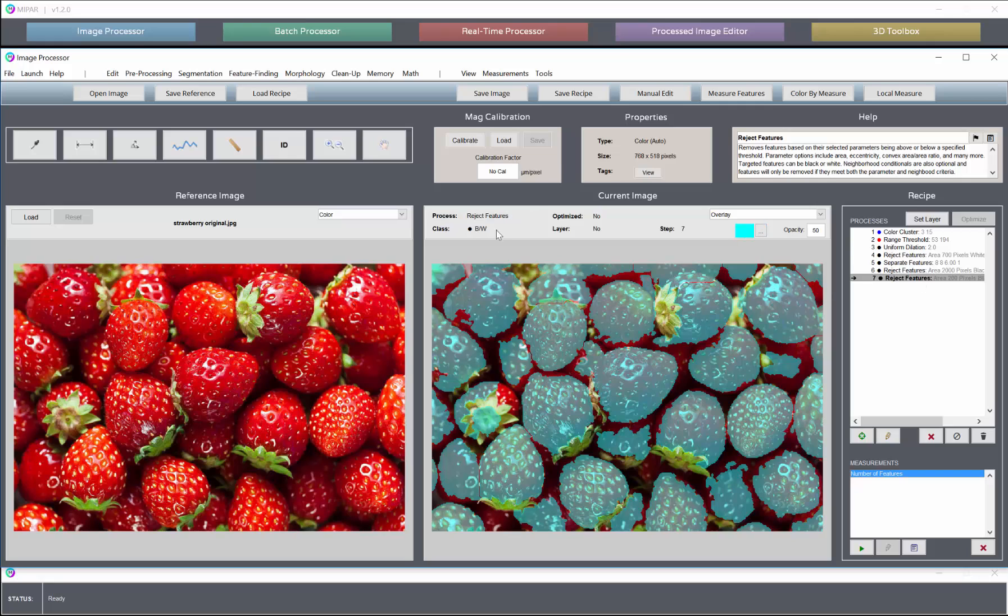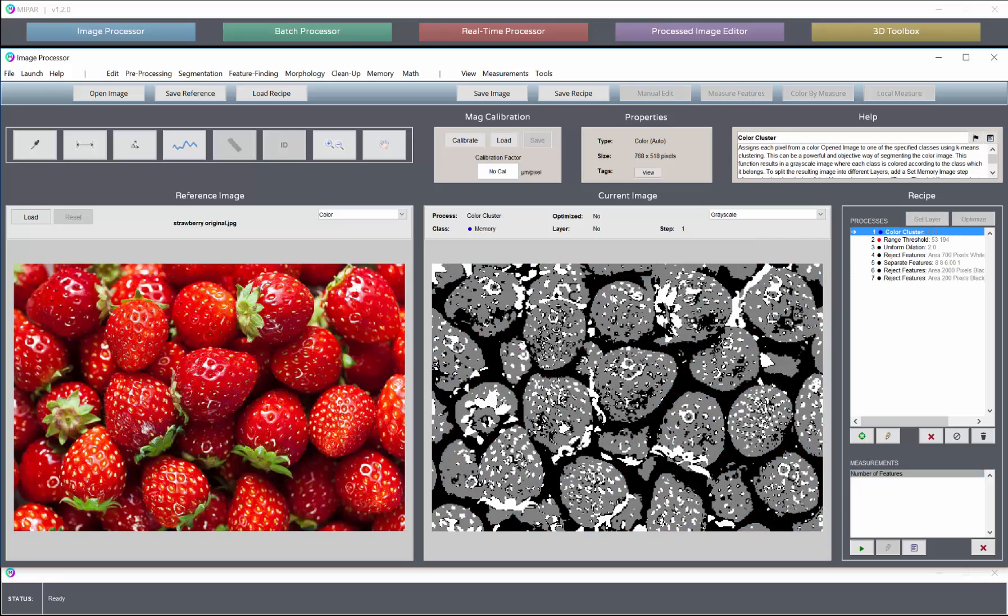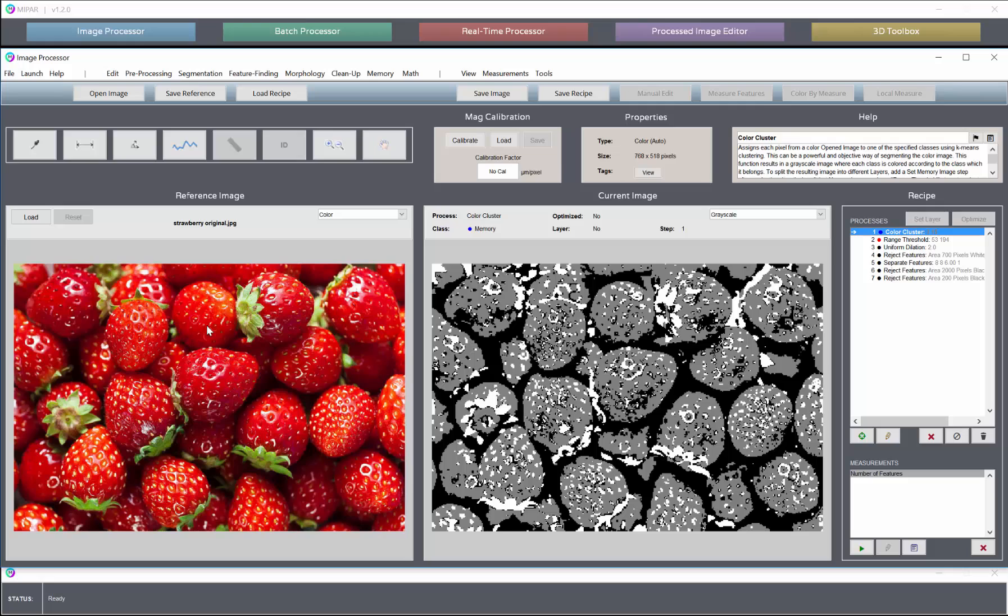But the main point of this demo was to illustrate the color cluster tool and how it can be used to objectively separate out color space from the original image without any threshold values. And this is certainly very applicable to a lot of bio examples where you have nuclei and cell bodies that stain differently.